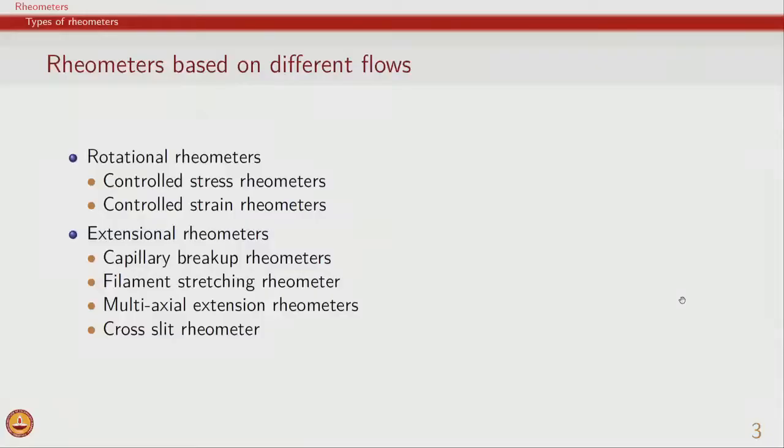So, but all of this is in the shear mode. Therefore, again, generally when rheology is being done, quite often we are using shear rheology, but as we have seen in our earlier lectures, extensional rheology is quite important for a variety of applications also. So, there are different sets of extensional rheometers which are available. Again, these are more difficult to operate and more difficult to interpret, but still, over the last 10-15 years, the popularity of extensional measurements has increased.